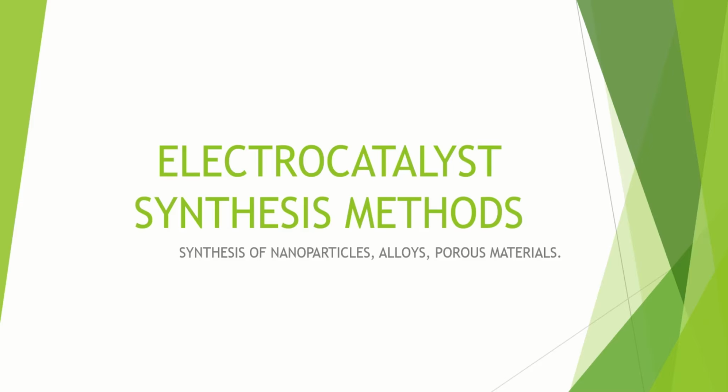Today we are diving into something super important in energy and catalysis research: electrocatalyst synthesis methods. Basically, how do we make nano-sized catalysts that can speed up electrochemical reactions like in fuel cells, water splitting and batteries? So let's break down the 8 most common lab methods.